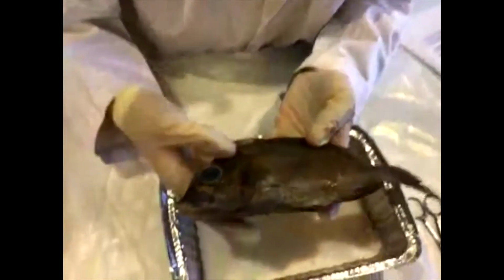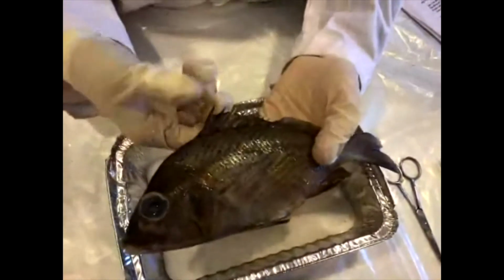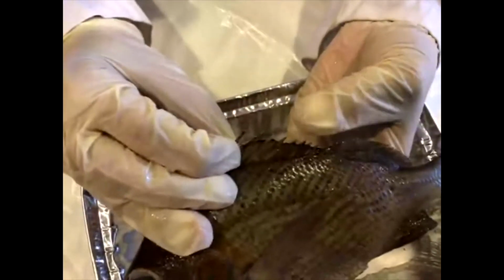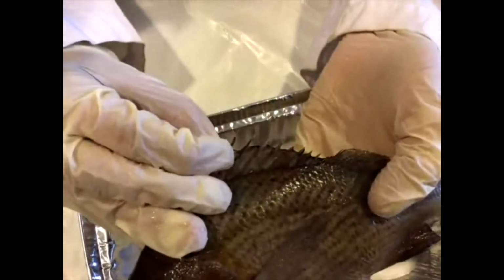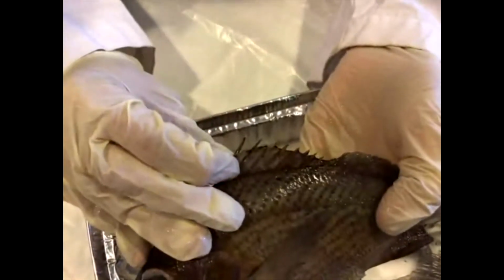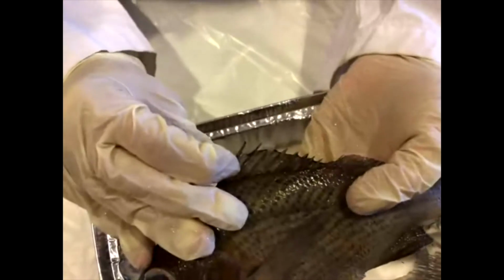Now, one of the next things that I'm going to show you is it's got a dorsal fin here. And what you may be able to see at the very top are some bones. Now, the perch is a ray-finned bony fish. And we call it a ray fin because these bones come out in rays. So this can be one of the first things that you draw along with. These bony rays are distinctive of this group of fish.